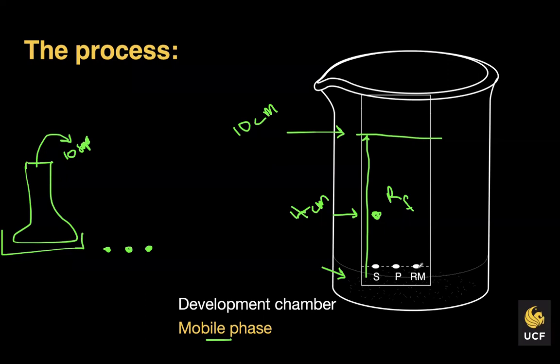So a reaction mixture, if we spotted it right away before anything, when only a few minutes have elapsed, we might see that we still have some of the starting material. And if the product, let's say, has an RF value right here, and we see another spot right here, it means the reaction hasn't really reached completion. We still have starting material and product within a reaction mixture, right? So it could be used to monitor the progress of the reaction as well. And we're comparing it to given or known RF values based on that solvent system.